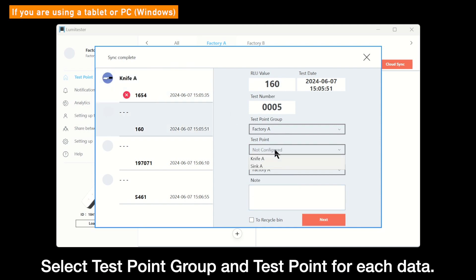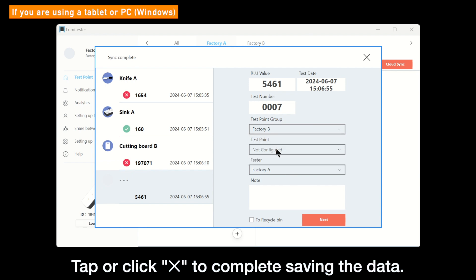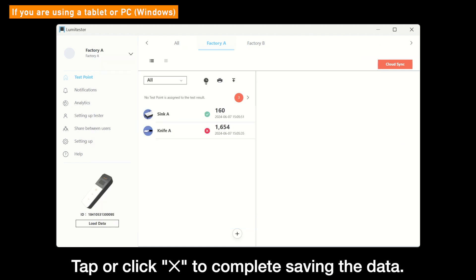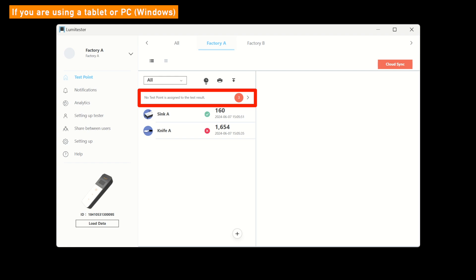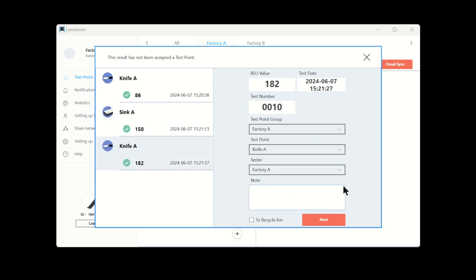Please set Test Point Group and Test Point to each data, and click Next to check the next result. When you have finished entering the results, click or tap the Cross button in the upper right corner to complete saving results. If you saved results without setting Test Point Group, Test Point, or Tester, the number of results that were not completely set will be displayed. Click here to resume your setting process.